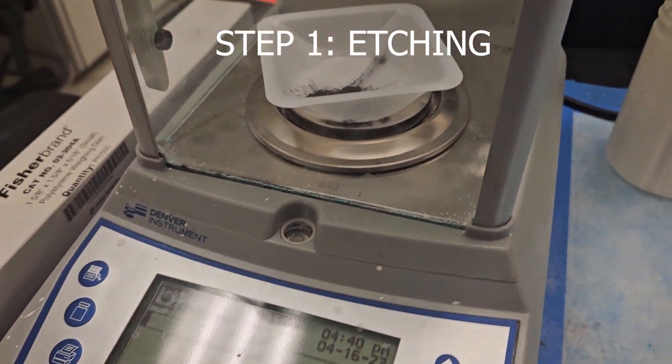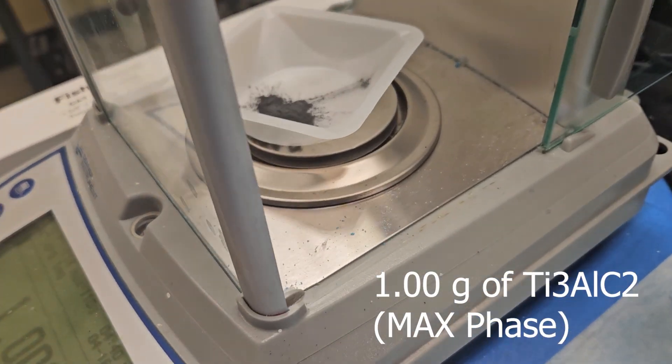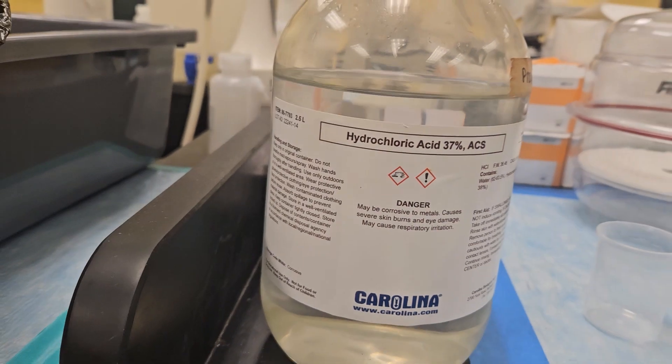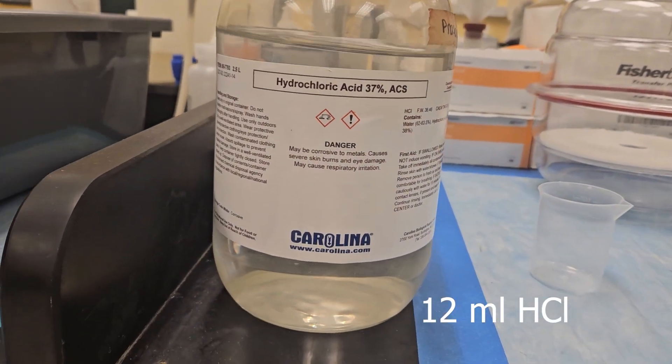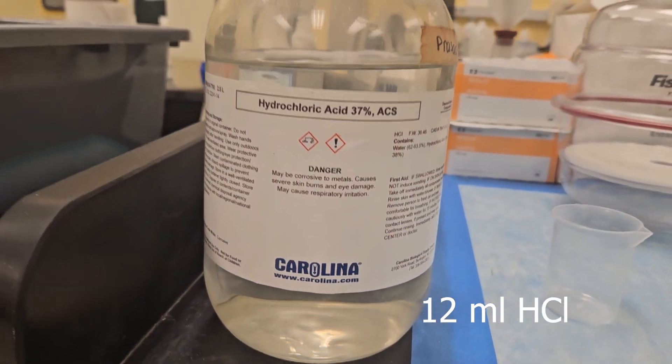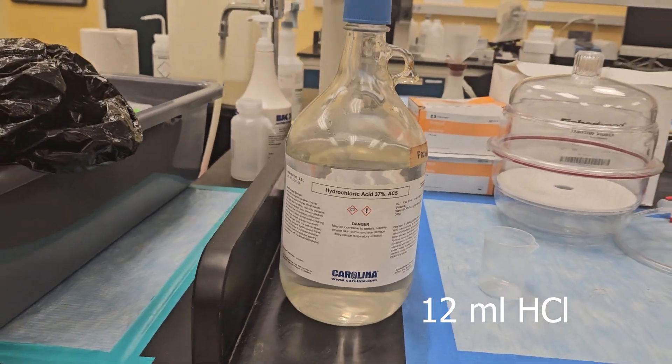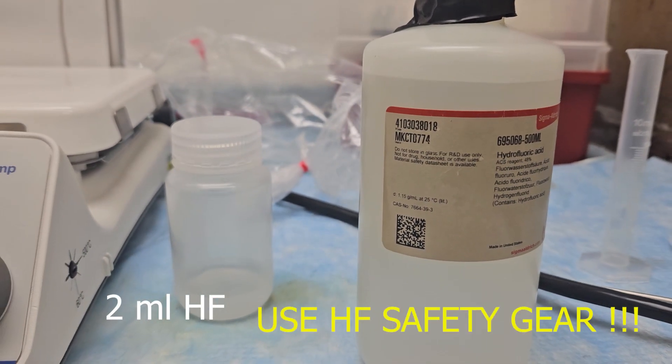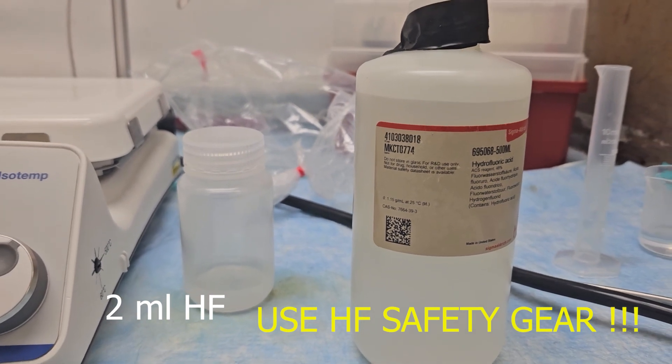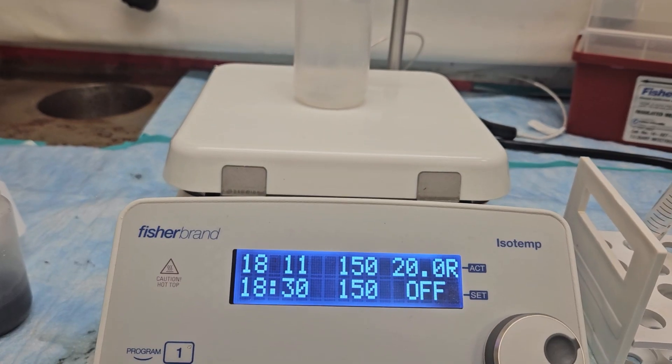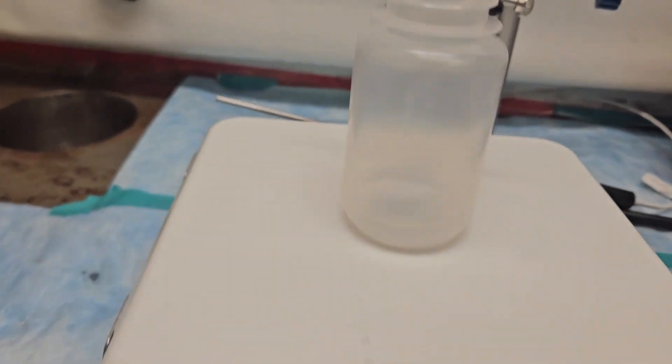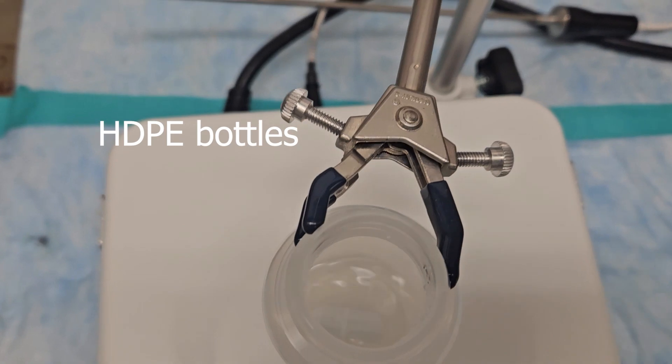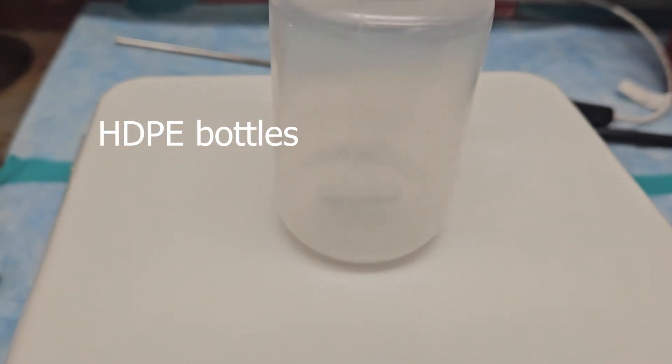Start by weighing out one gram of titanium aluminum carbide, and we're going to combine that with 12 milliliters of hydrochloric acid and 2 milliliters of hydrofluoric acid. It's very important that you have your hydrofluoric acid spill kit nearby, as well as your hydrofluoric acid safety gear on hand. Additionally, hydrofluoric acid is an etching agent to glass beakers. Therefore, the use of high-density polyethylene bottles is highly suggested.